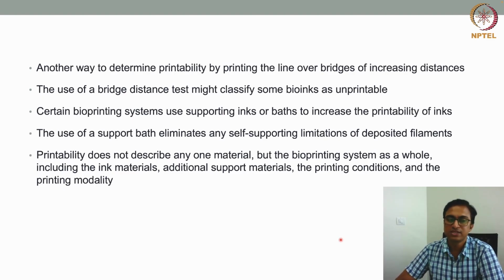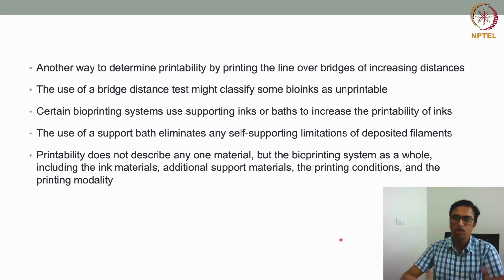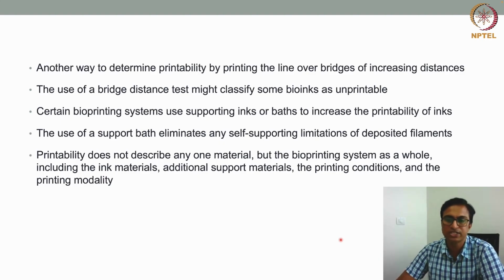So that means we can now define that printability doesn't describe any one material. We cannot classify a bioink as not printable based on a certain test, because it also depends on the whole system, including the ink materials, additional support material, the printing conditions, and the printing modality.